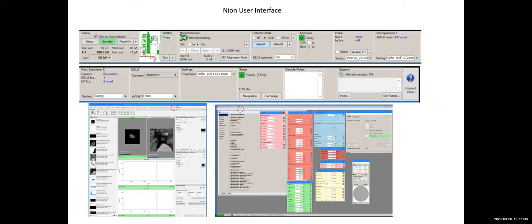So you need to pay attention if in the column part, you see some yellow or red color. In the side pipe, you can see there is a red color. This is the peripheral pipe and it's isolated from the chamber, so you don't need to worry about this red segment. There are some hidden panels here we don't normally use, and when you are working on a microscope, you're welcome to click and try what is hidden.